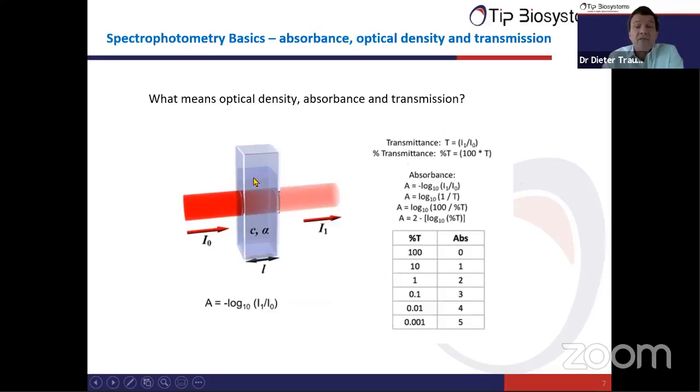If the sample has no optical density, if there's nothing in the sample that absorbs the light, then all the light coming in also passes through and comes out. But optical density means there is a substance in our sample that absorbs one particular wavelength, or different particular wavelengths, or a band. This means less light is coming out than goes in. And that is what we measure at the end.